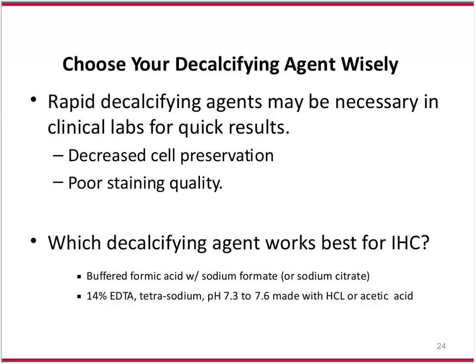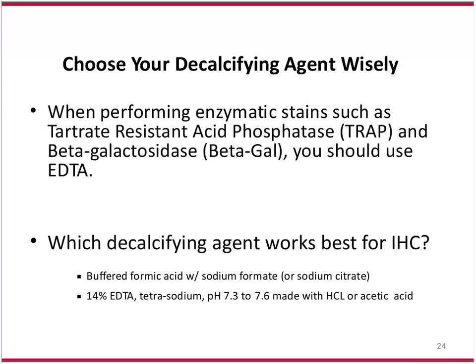Well, what I will tell you is whatever decalcifying agent you are using in your lab, you better make sure that you do a trial run of the immunohistochemistry on your antibody, and have some extra slides before you do the whole deal, so that you haven't wasted reagent and time. We do lots of preliminary work here.